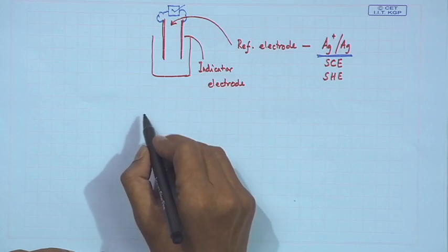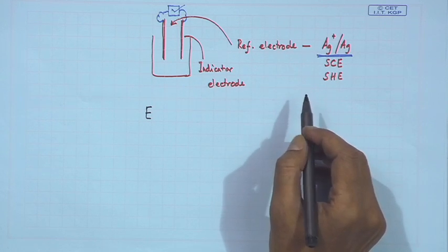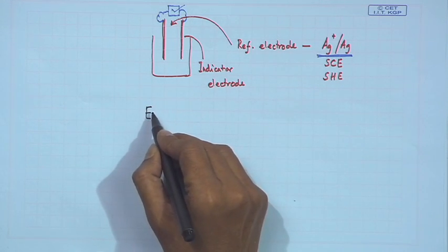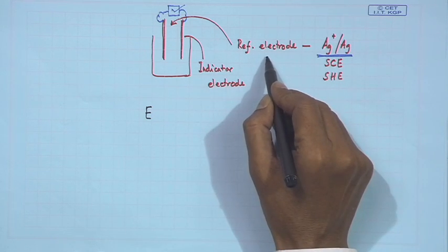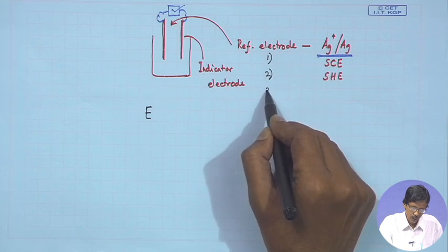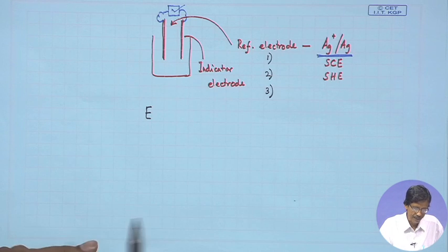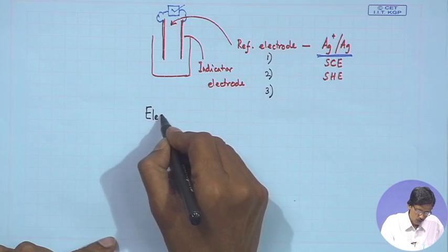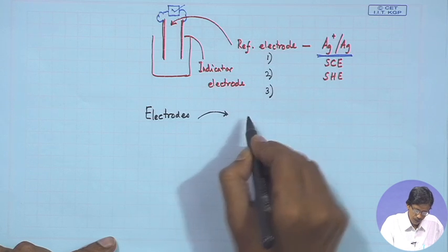Welcome back. So, we will be considering the different electrodes. The most important component we have seen in our previous class is how you arrange the reference electrode as well as the indicator electrodes. There are different reference electrodes in our hand, and the typical or very basic design of these electrodes, and how we can use them for your titrations.